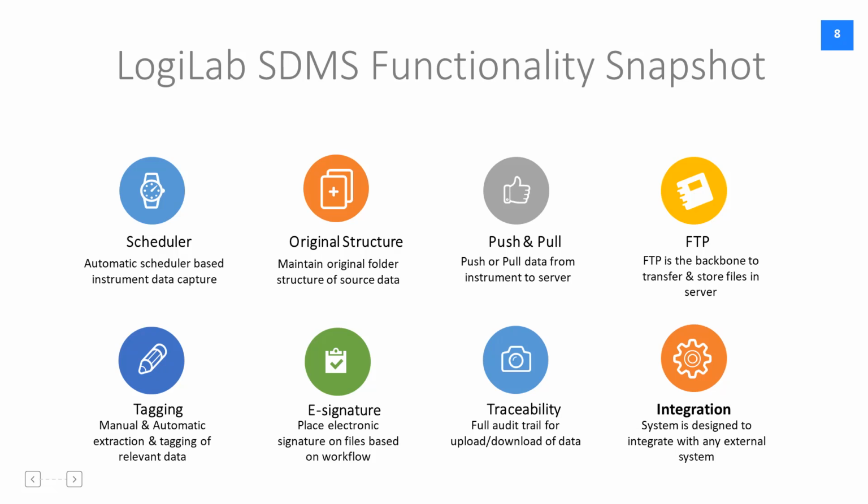There is a 100% log of each and every file that is being uploaded to the system. Even if there are any failures or failed reattempts, the system will audit trail each and every event that is happening inside the system. There is a full traceability of all events within the system with respect to 21 CFR Part 11. LogiLab SDMS is also designed for integration with external systems.